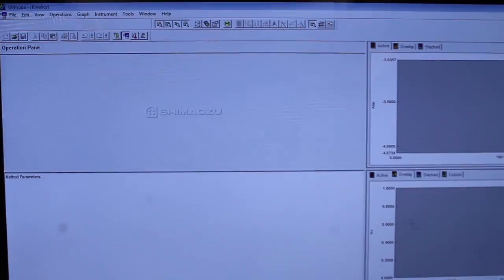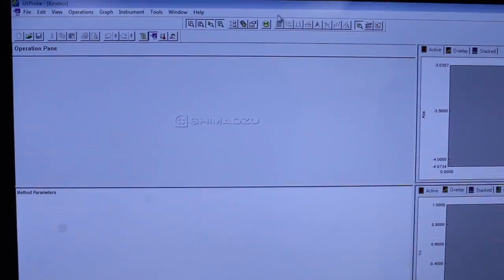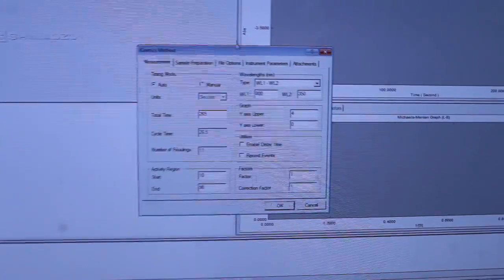Before you record the baseline, set your desired wavelengths by clicking the kinetics method button and typing your wavelengths into the WL1 and WL2 boxes.